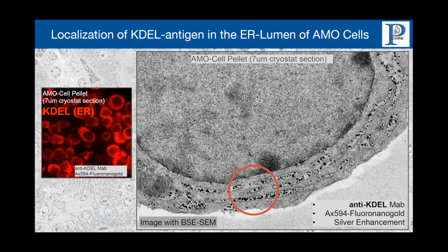Okay, next question from Isabel. What is the thickness of your SEM sections? Another wonderful advantage of doing wide field imaging on glass slides is that we can accommodate any thickness of interest. So we can image 100 nanometer sections, 500 nanometer sections, up to 1 micrometer sections. Another advantage is that you can stain the top of the section. After we prepare the sections on the glass slide, we do an additional uranyl acetate and lead citrate stain. We never get charging, never. It's really solid, robust, no problems.